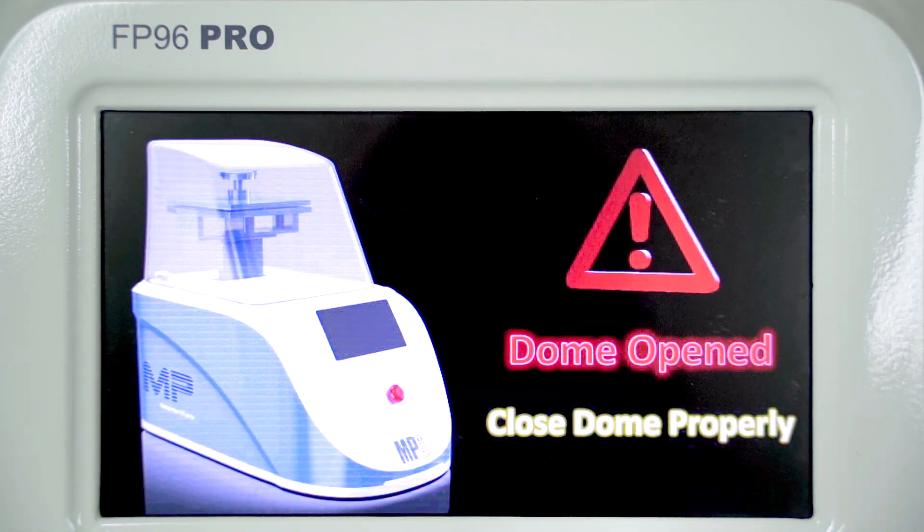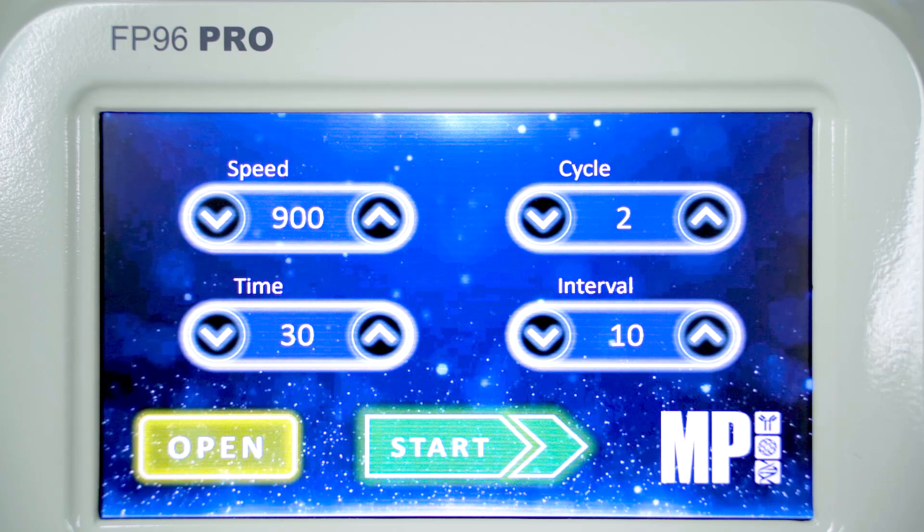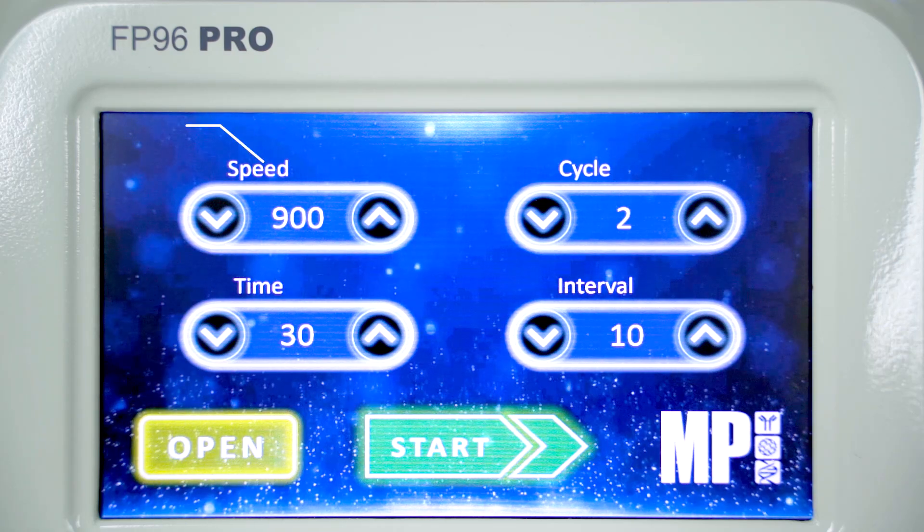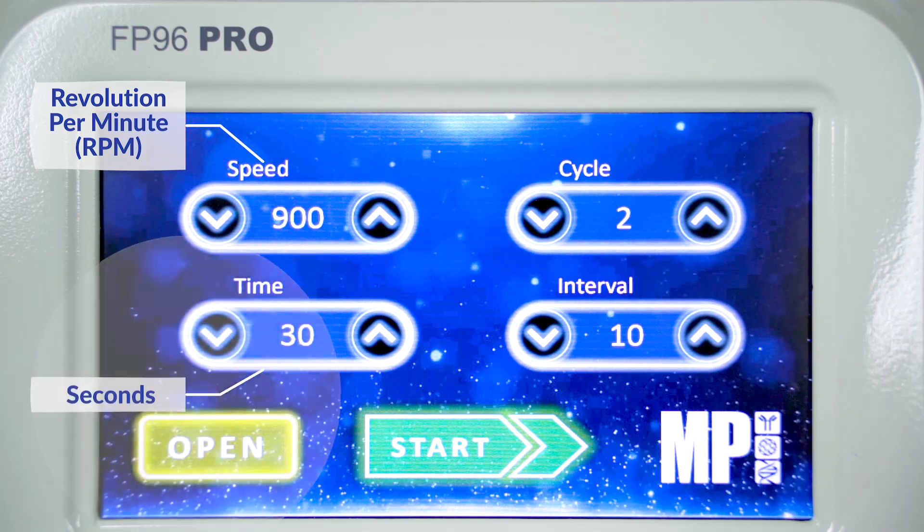The interface displays the program screen with various parameters. The speed indicates the RPM of the machine during operation, while the time is displayed in seconds.